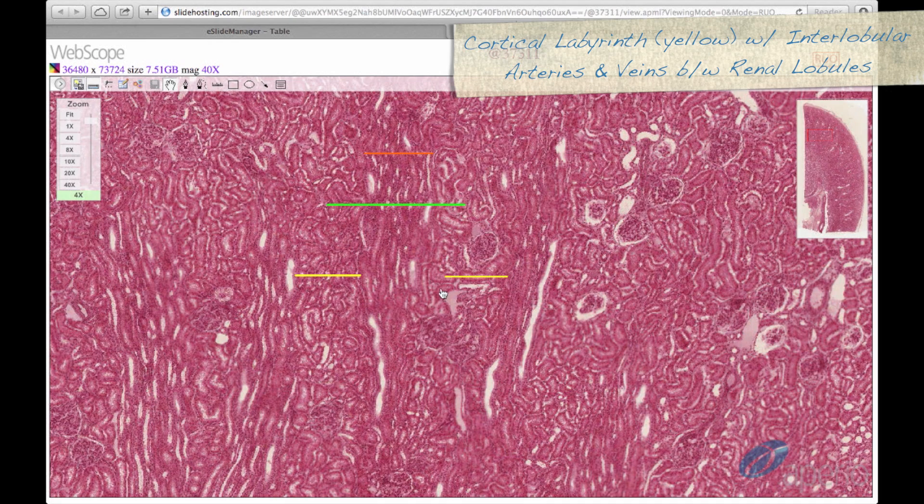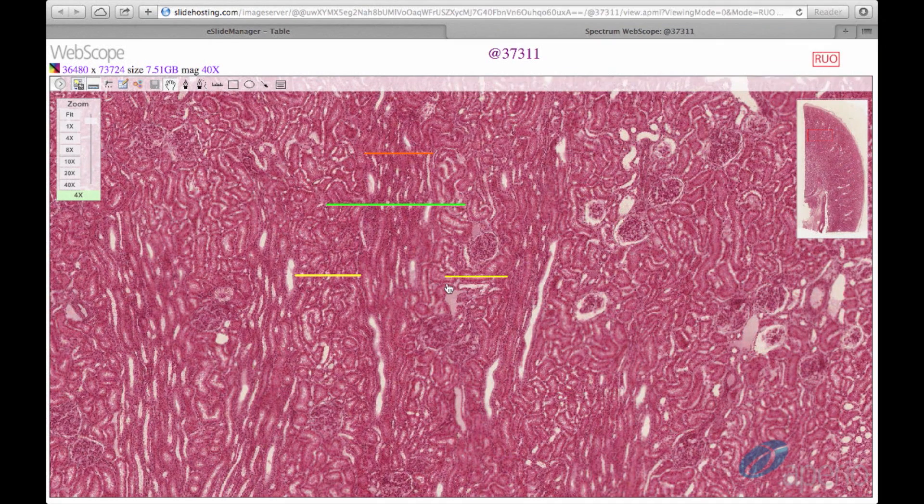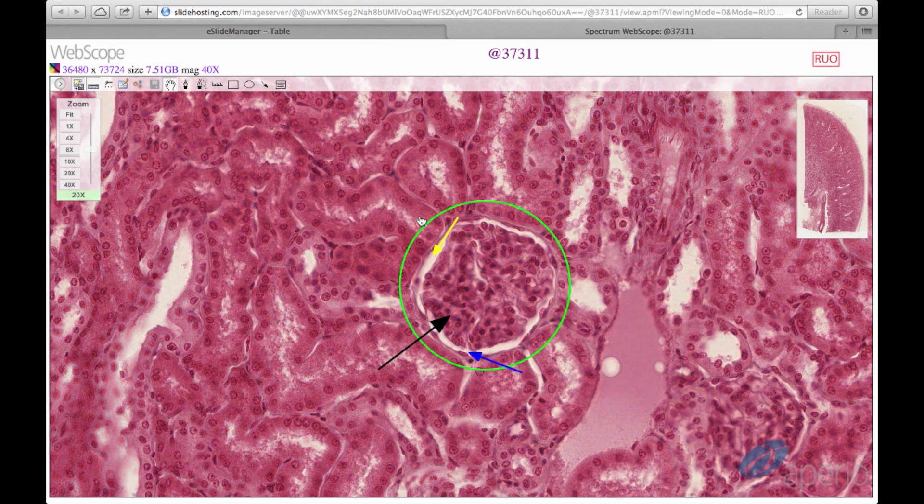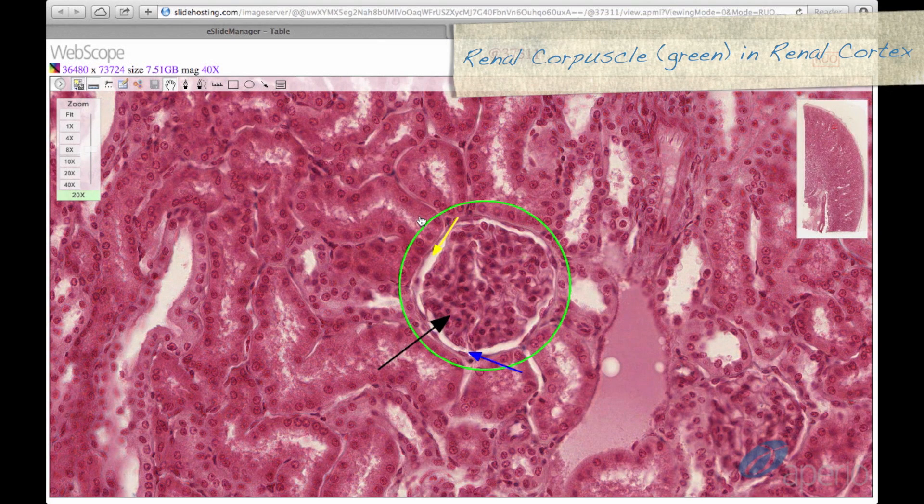Renal lobules have interlobular arteries and veins running between them. We have zoomed in on the cortex to observe the renal corpuscle, circled here in green. Please note that the renal corpuscle is only found in the cortex.